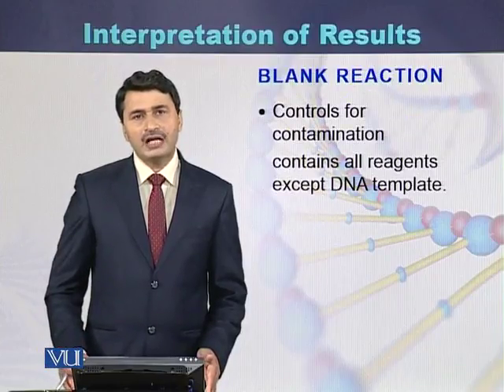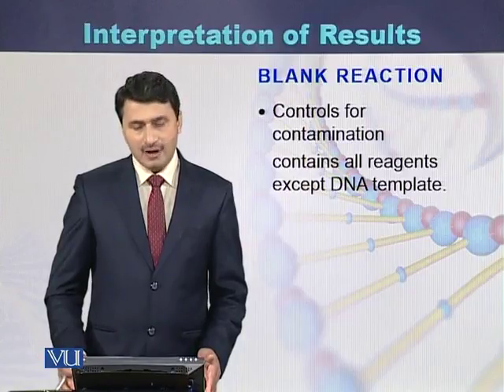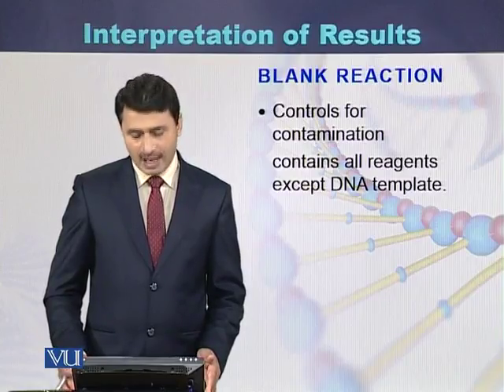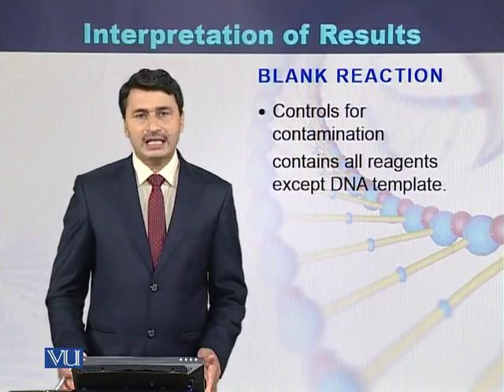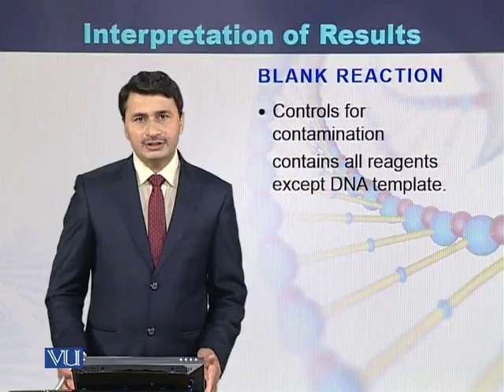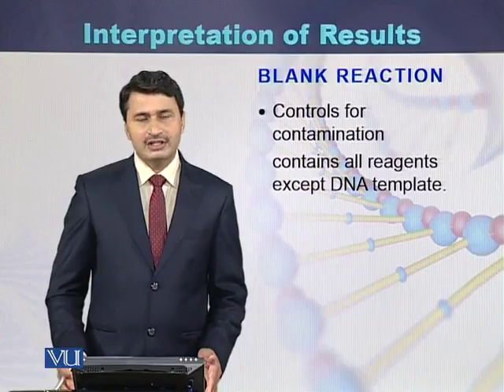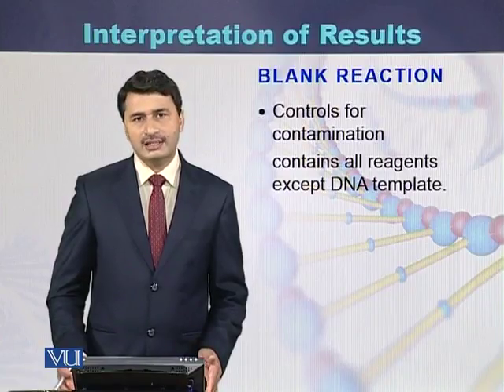So while performing a PCR reaction, for better interpretation of the results, there should be a blank reaction. What is a blank reaction? A blank reaction is to control for contamination, and it contains all the reagents except the template DNA. One is the main reaction in which there are all the reagents as well as template DNA, but in the tube that is called the blank reaction, there should be all the reagents. There will not be DNA in this reaction. So that reaction is called a blank reaction.